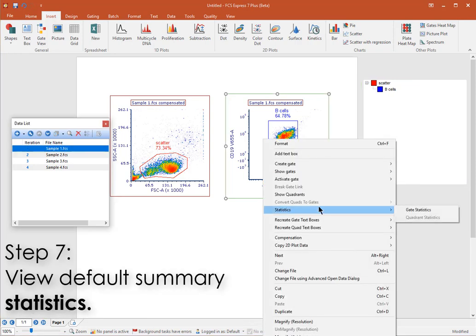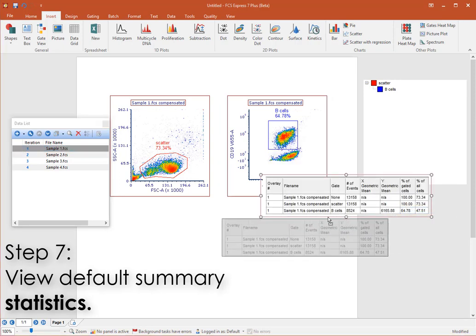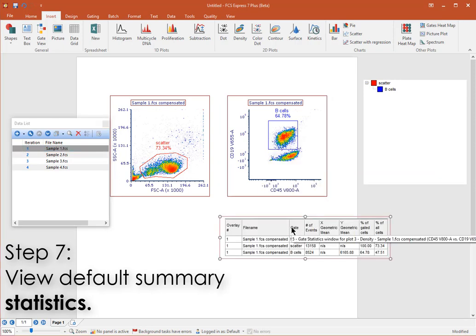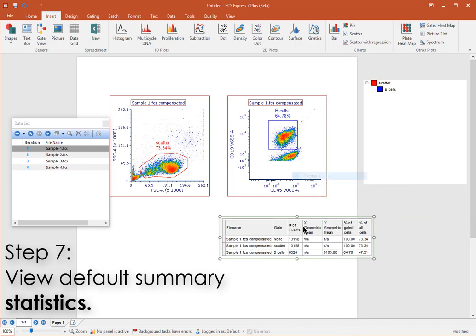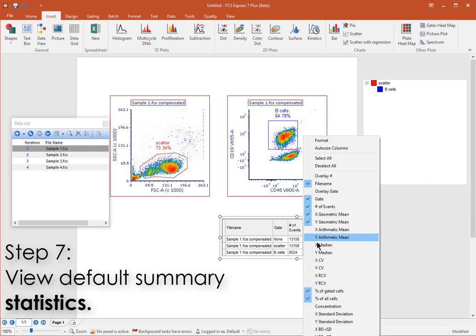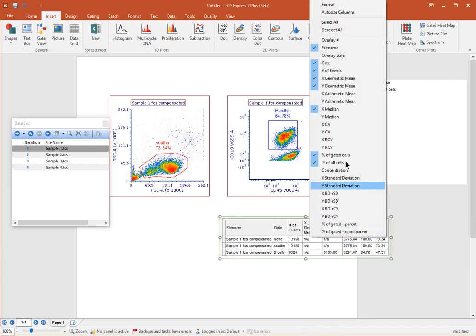In FCS Express, you can view default summary statistics from any plot. The statistics will reflect the population that the plot is gated on. Simply right-click on the plot and choose Statistics to insert the default summary statistics table. You can right-click on the Statistics window to add or remove any desired statistic.